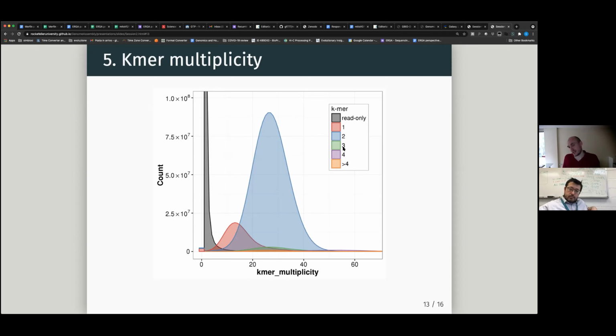And here there is also something that is 3 copy, so it's green, but it's at the same level as the 2 copy peaks. These are the false duplications that we were talking about before. You basically duplicate a gene artificially, so it should be present only in 2 copies, one from the mother, one from the father, but you see 3 copies. But actually the coverage support is supporting only 2 of these copies.